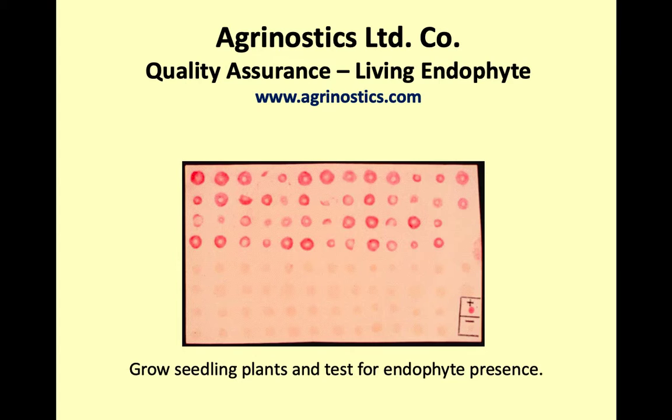So we come back after we've grown a tall fescue plant for 6 weeks, and we harvest the base of the tiller. We make a little wafer, a cross-section of the stem base, and we lay it on our membrane. We extract the proteins the antibodies are sensitive to, and we use a slightly different color reaction, but this is what you see. These pink circles here are stem bases that are just sitting on that membrane. And here are stem bases in which there's no endophyte in that tall fescue plant.